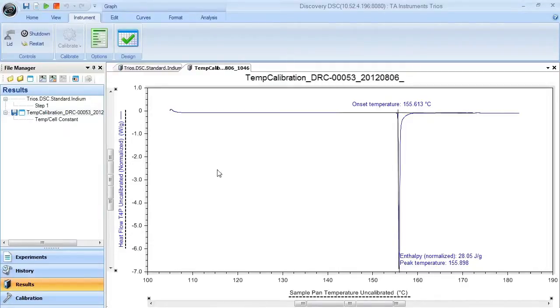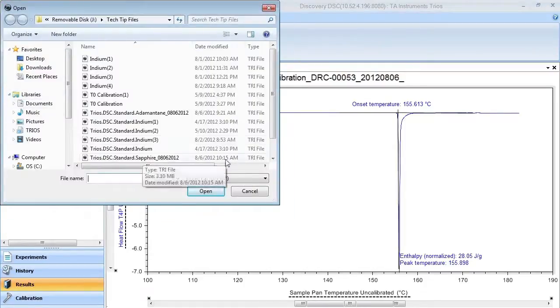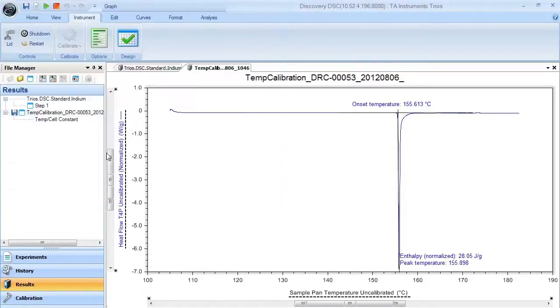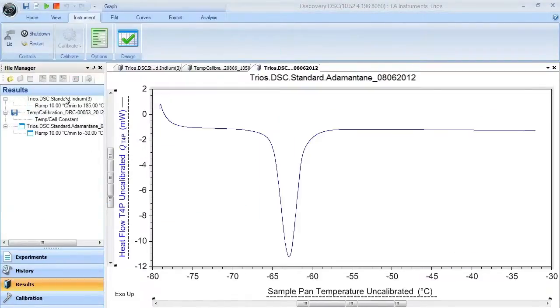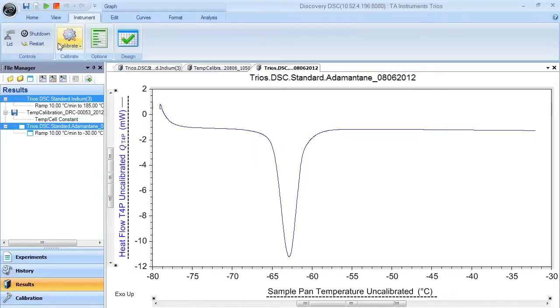This will also enter information into the cell constant and temperature table. If you'd like to enter multiple calibration sets into your temperature table, you need to make sure that both data files are open. If you select both the indium and, in this case, the adamantane, the calibration button will become active again.